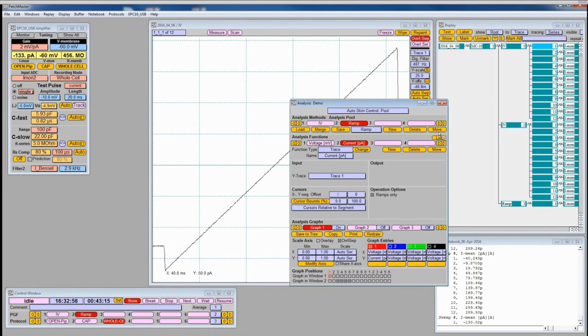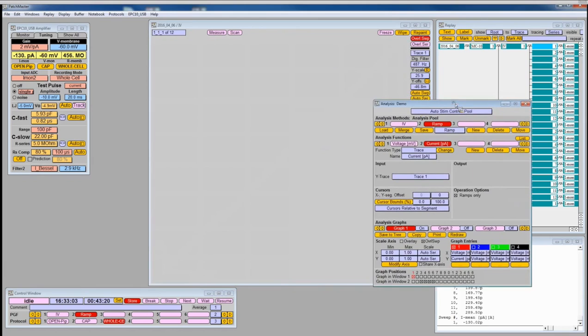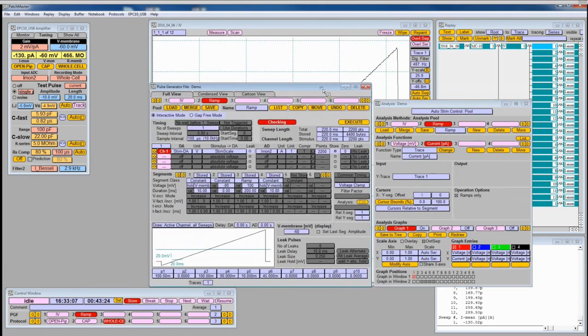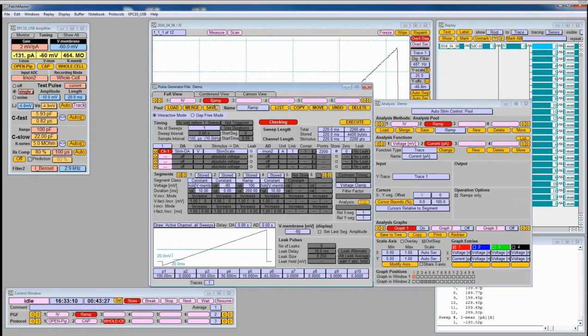Okay, now I can basically close this, or actually before I close it, I should leave it open so that you see in a minute also how I still have to link it. Because as you remember, the ramp protocol is selected, so this is the ramp protocol that we want to execute, but we haven't linked it yet. So you need to link it to this ramp method. Okay, all you do is basically you give it the correct name. The correct name has to be matching.